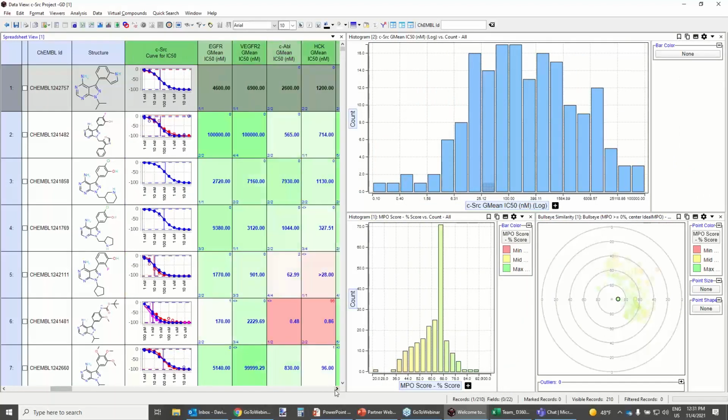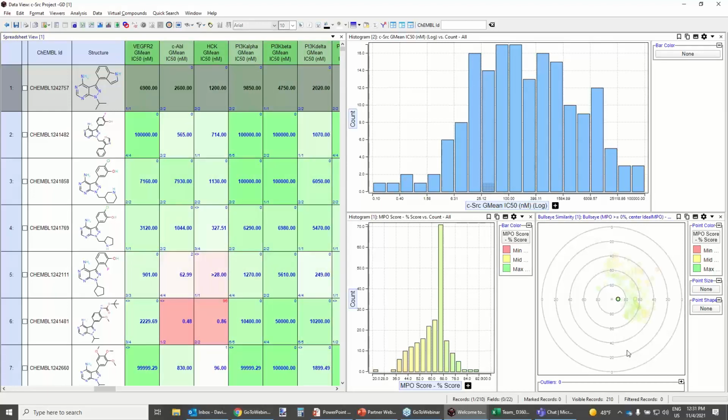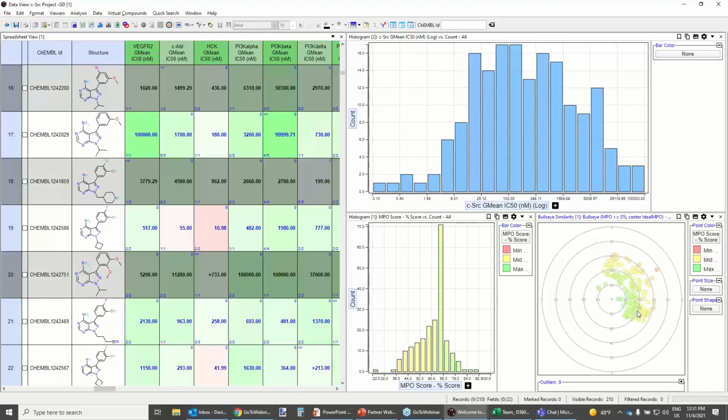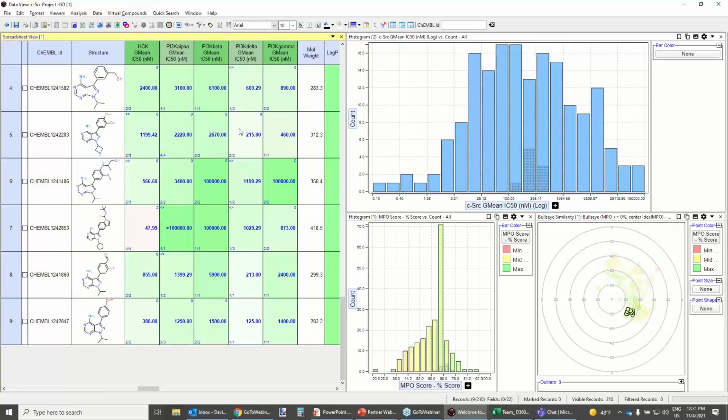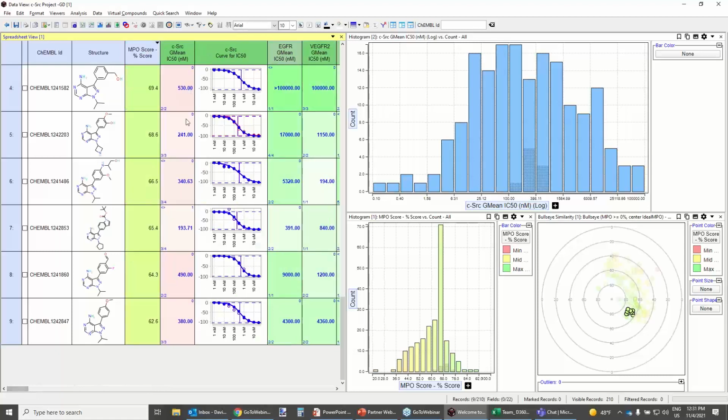If we just shrink this down a little so we can see a little more data and have a look at our assay data, especially our selectivity assays. The nice thing about this bullseye plot is, we can see, for example, that there are some points down here which are all about 70% equivalent to what we're looking at. When we look at those compounds, we actually find that they're mostly green in terms of our selectivity assays. We can see this a little more clearly if I just make this a details viewer. So we're green here, but we are not so good on our primary activity. So this group of compounds is 70% similar to our targets, but has a problem over here in our primary assay.